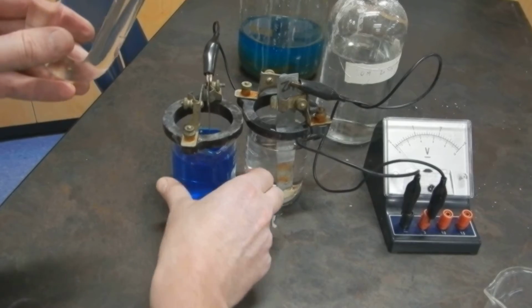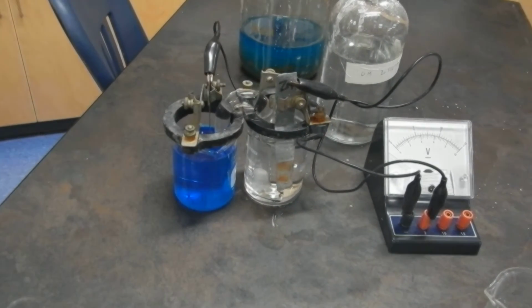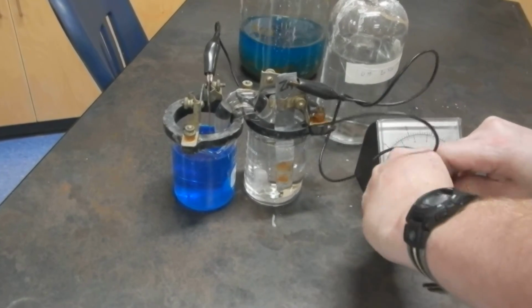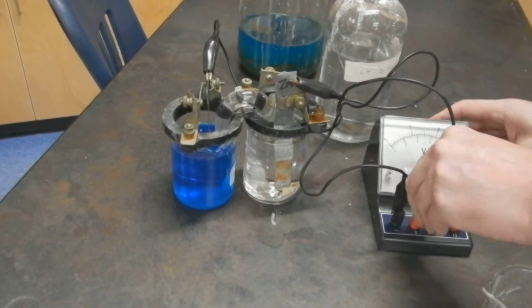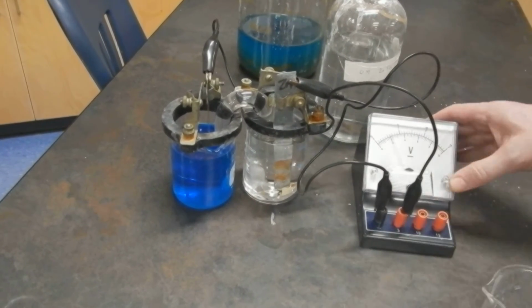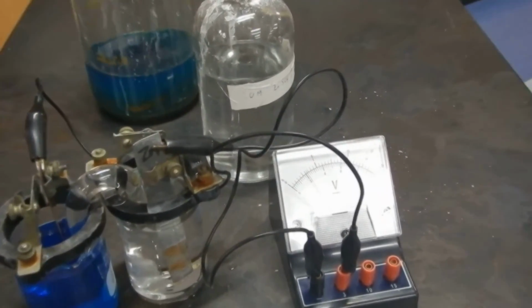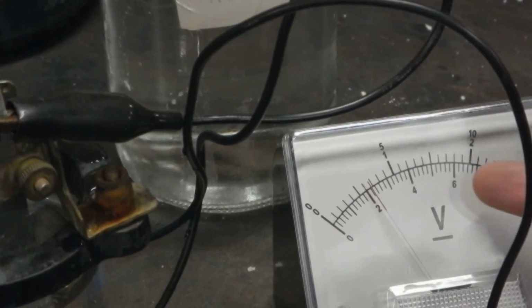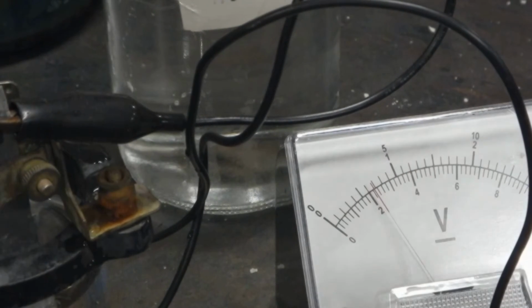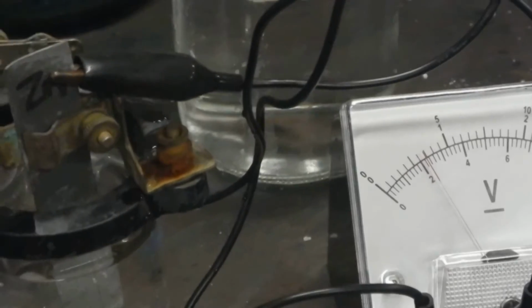I got to have these things close together so I can connect them together, and then we have to see what we made. Let me hook up the voltmeter. Well, that sounded promising. And so if we zoom in on the voltmeter, you can now see the needle, and we are making in the order of somewhere around 0.65 volts. I didn't do this under standard conditions.